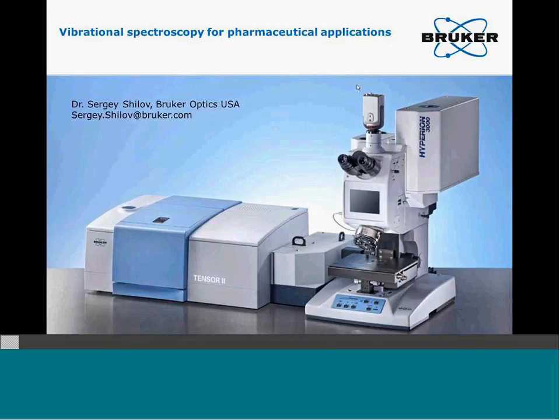This is the introduction. This presentation will be about vibrational spectroscopy for pharmaceutical applications. In the first few slides, I will give you very basic information on what FTIR spectroscopy is, and review applications for FTIR spectroscopy, and then we will switch to Raman vibrational spectroscopy, and I will also show you applications of Raman vibrational spectroscopy.